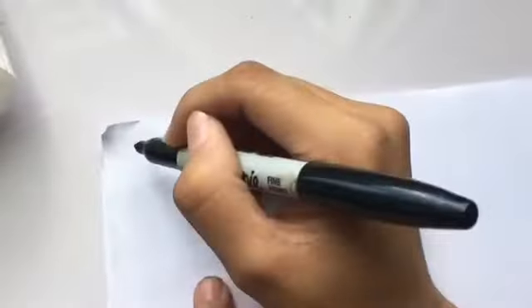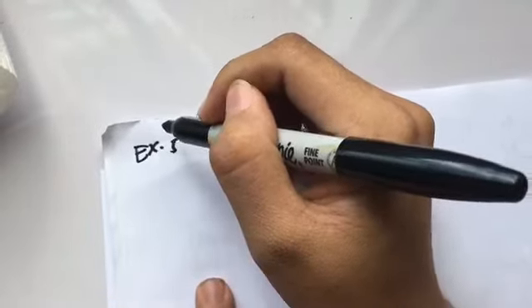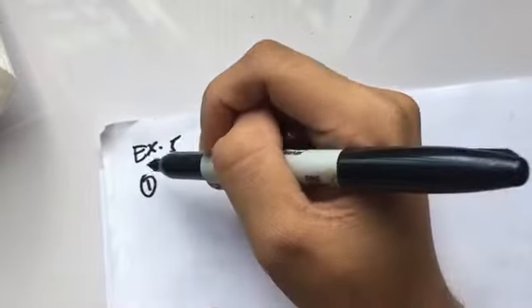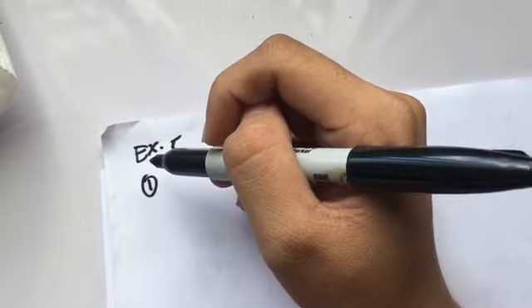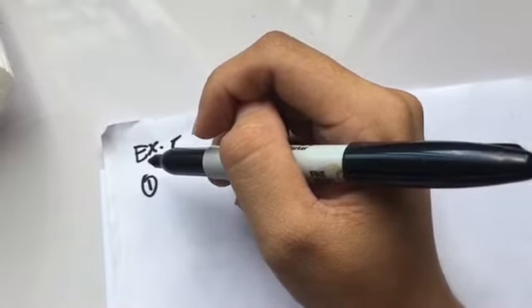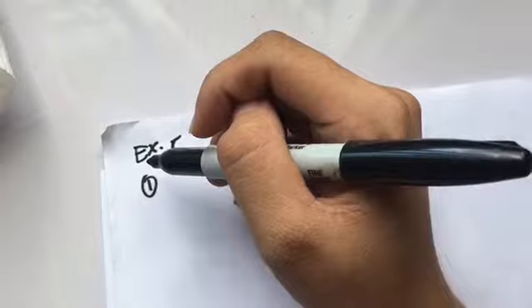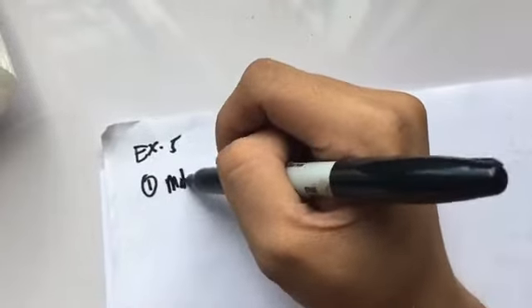So we are going to discuss experiment number 5, which is the hydrolysis of salt. The objectives of experiment number 5, hydrolysis of salt, is first to identify whether an aqueous salt solution is basic, acidic, or neutral depending on the molecular formula.